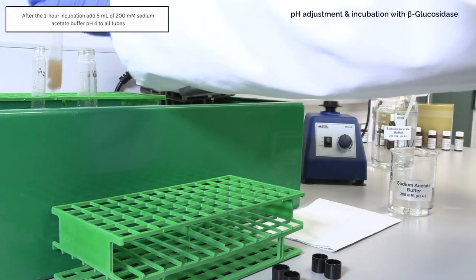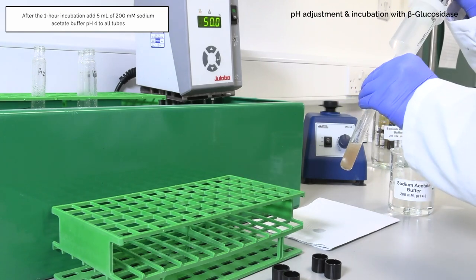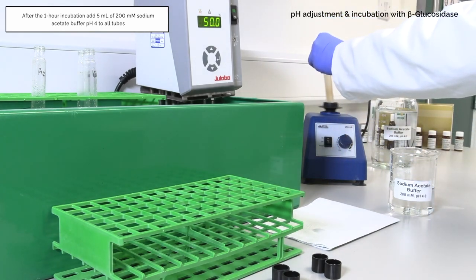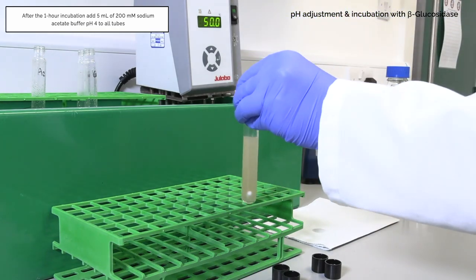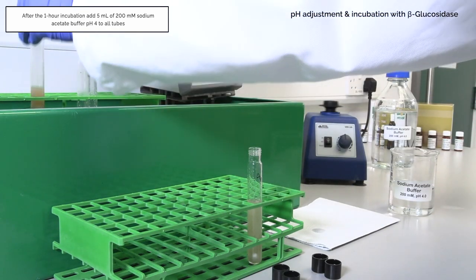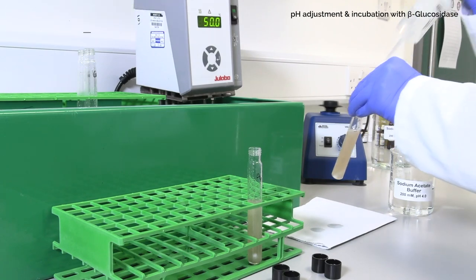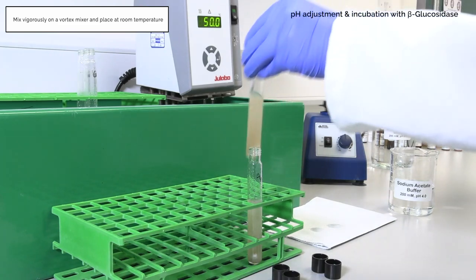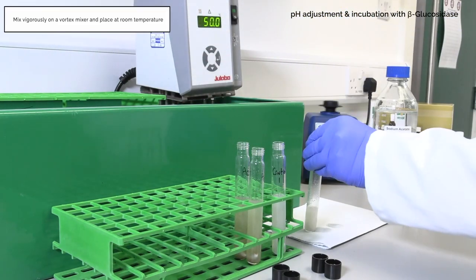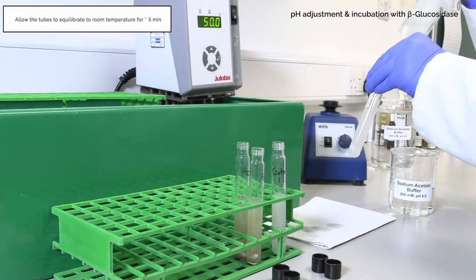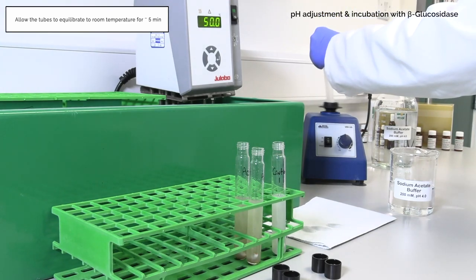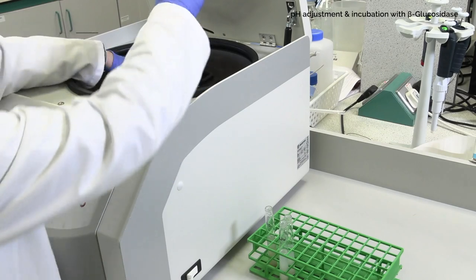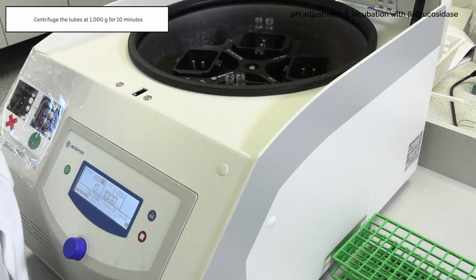After the 1 hour incubation, remove the caps from the test tubes and add 5 milliliters of 200 millimolar sodium acetate buffer pH 4. Mix vigorously on a vortex mixer and place at room temperature. Allow the tubes to equilibrate to room temperature for approximately 5 minutes. Centrifuge at 1000 g for 10 minutes.